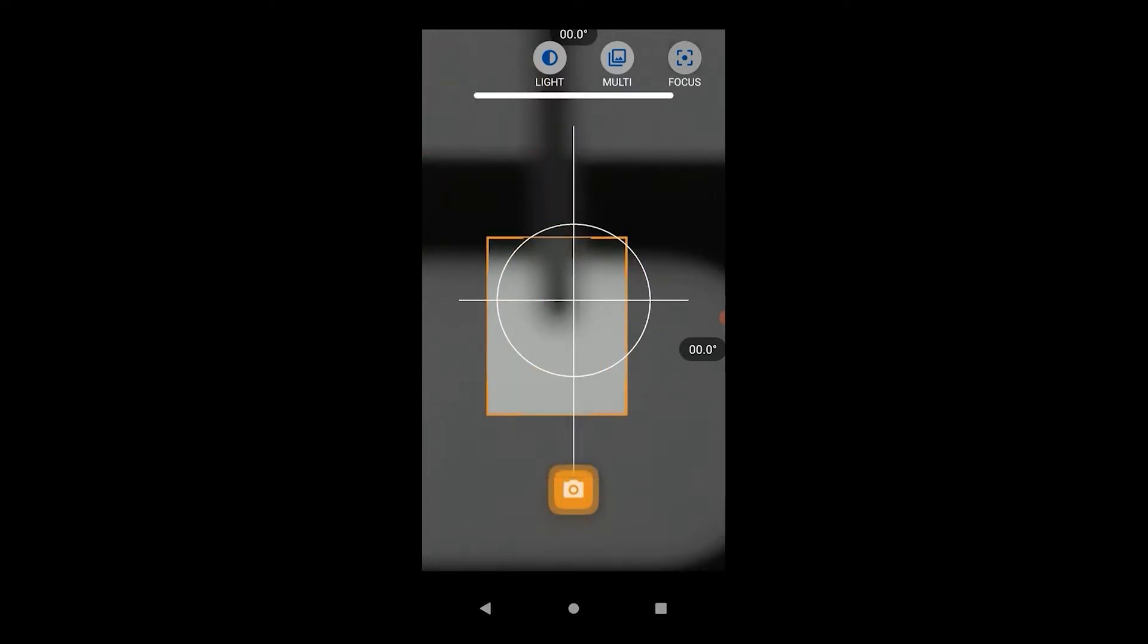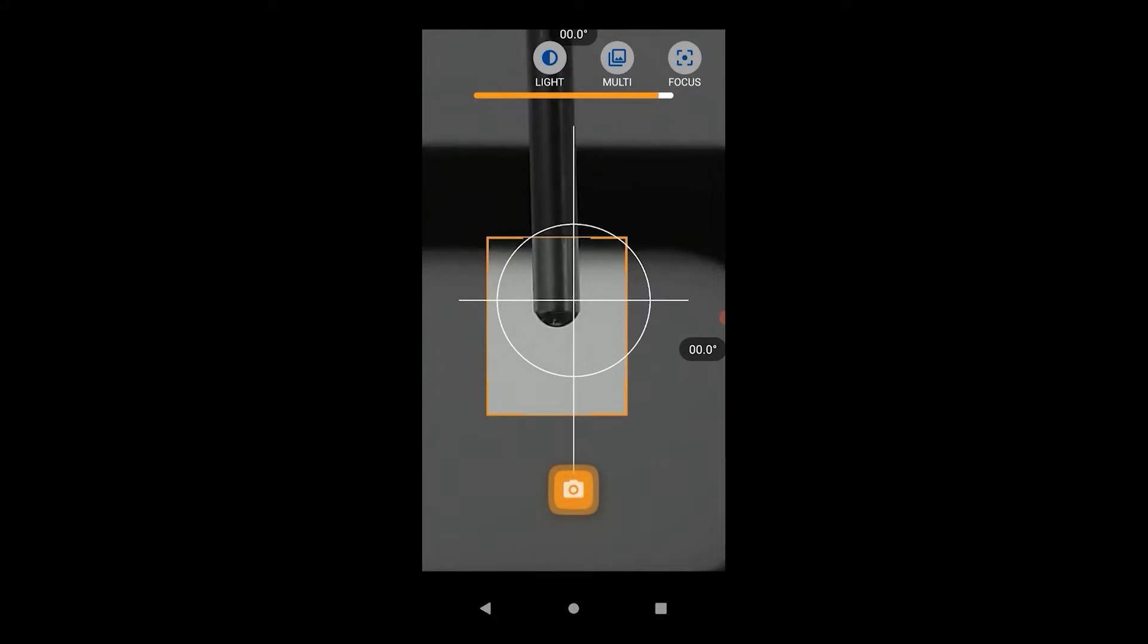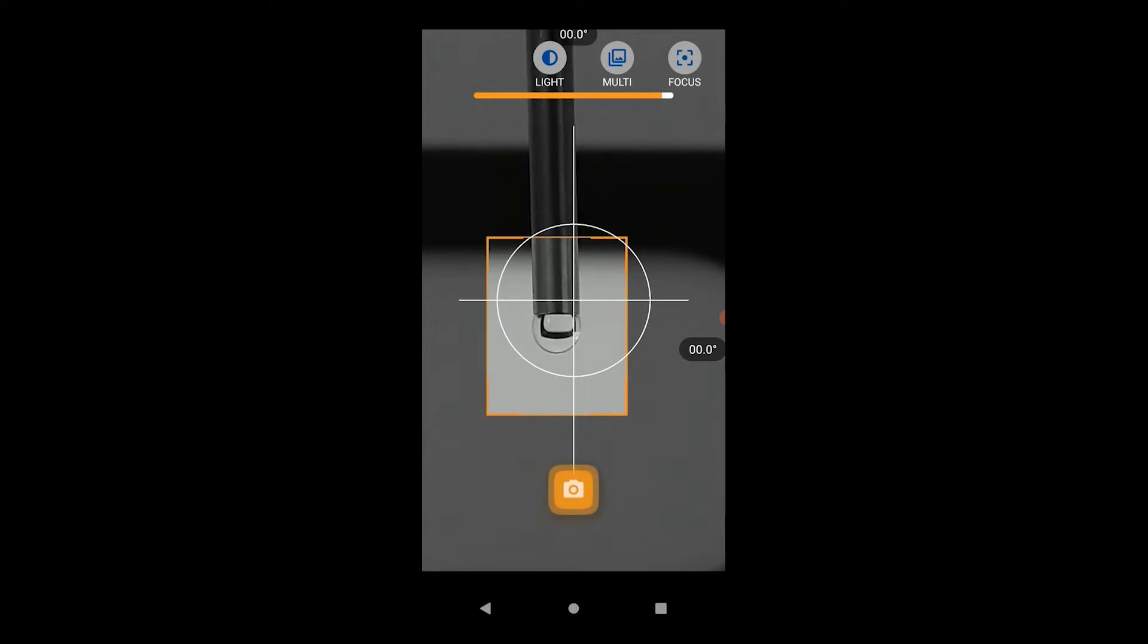Before adjusting the focus on the image, generate a droplet as a reference. Use the focus slider to focus on the droplet. To get the best results, the focus slider should ideally be as close to the maximum value possible.